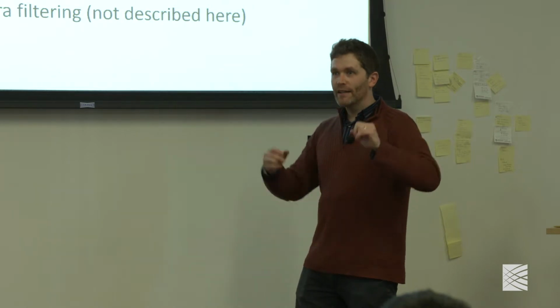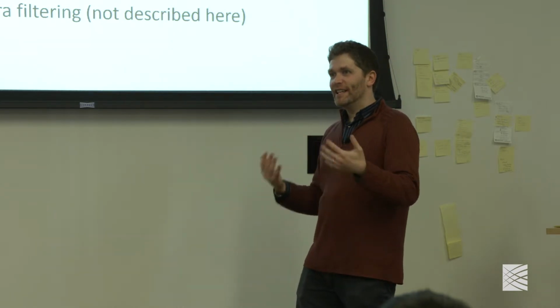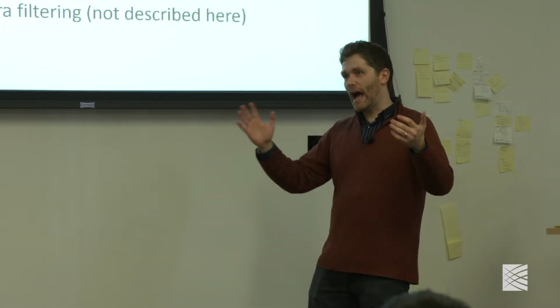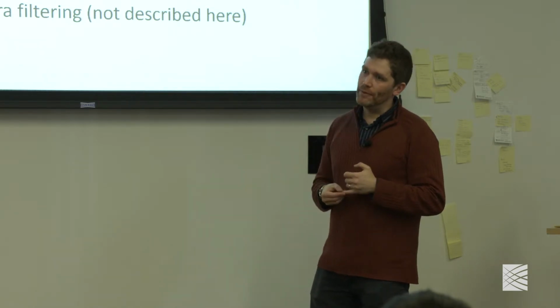But that's why, on the GATK side, we have a forum you can ask, and the developer of Mutect2 in particular is a big fan of helping users. I am too, but you're going to get him before me. The other thing to keep in mind is copy number variants. You're not going to call that through RNA.